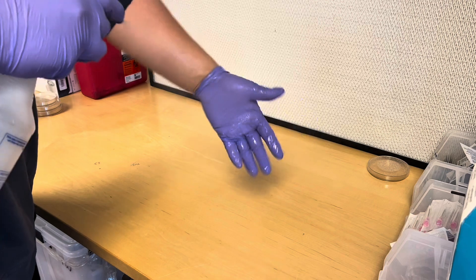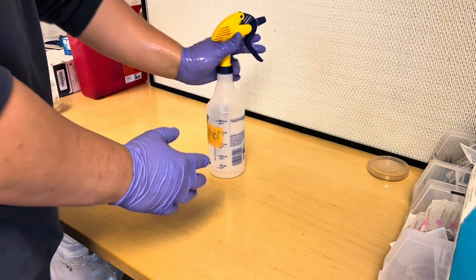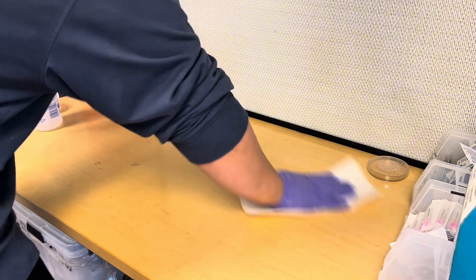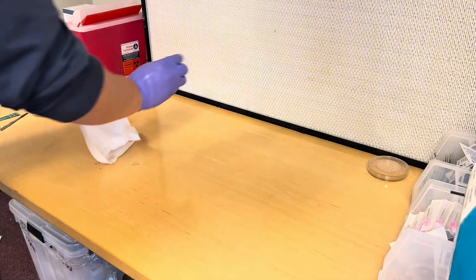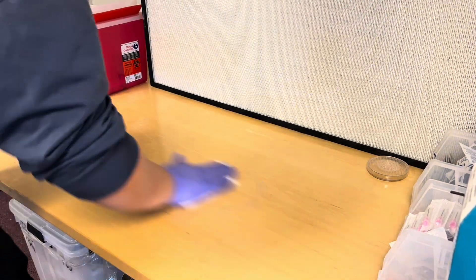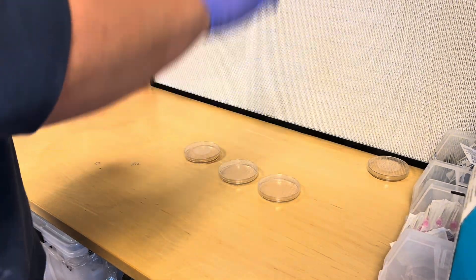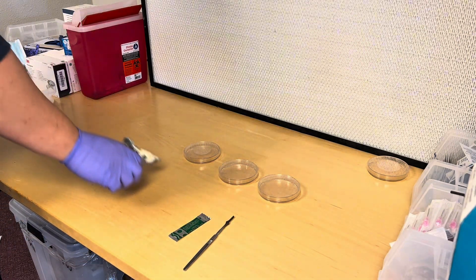I'm in front of a flow hood right now. A flow hood has a HEPA filter in it — it blows clean air out. It's pretty expensive, so if you're just getting into mycology you probably don't want to buy one. What I recommend is going to a space in your house with the least amount of airflow. I actually grew mushrooms for two years out of my closet, so you can do it too — just make sure you have as little airflow as possible.